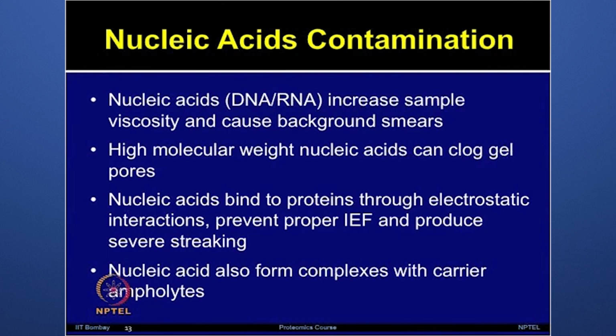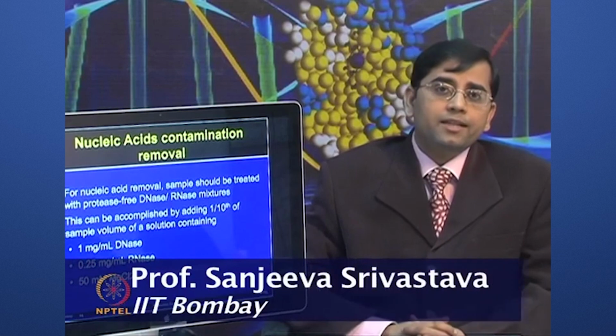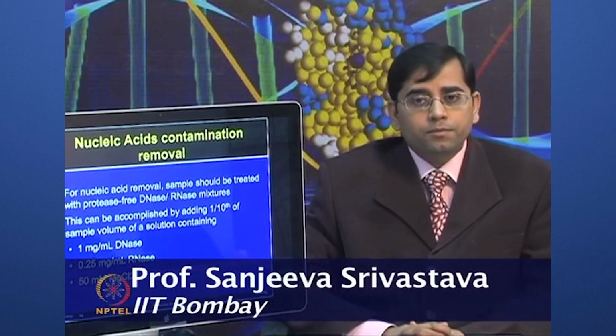The nucleic acid can also form complexes with the carrier ampholytes, which are added during the isoelectric focusing step. So, how do we remove the nucleic acid contamination?